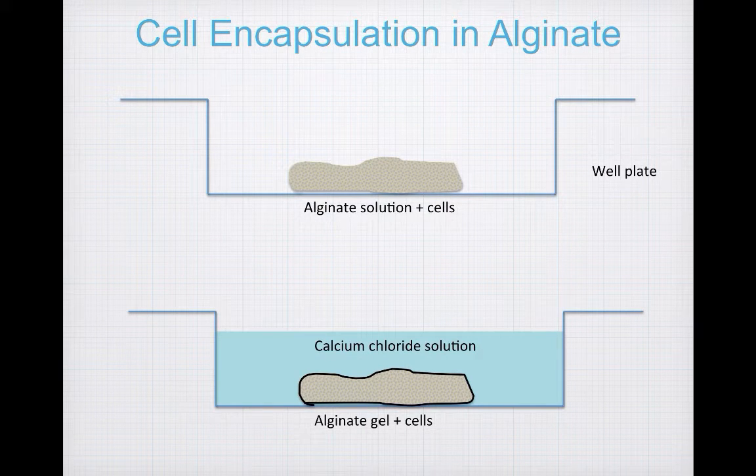And in this lab, we're going to be doing something slightly different than before because this time we're encapsulating cells within the alginate, but last time we didn't encapsulate any cells. So what we'll do is we'll suspend the NIH3T3 fibroblasts in solutions of alginate, place them at the bottom of the well, and cover them with calcium chloride solution. This will cross-link the outer surface immediately, entrapping the cells within the solid gel and allowing the inside of the gel to become a culture environment for the cells. The cells inside will not only proliferate over time, but begin to synthesize their extracellular matrix.